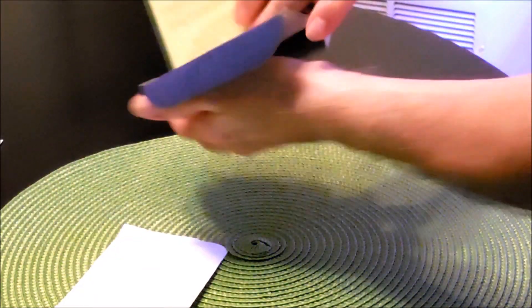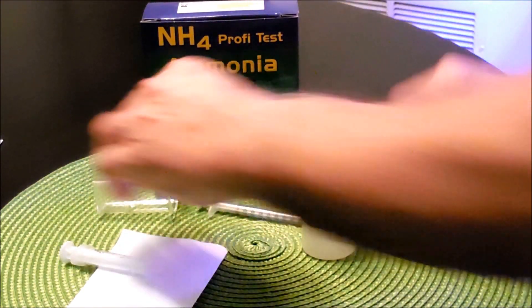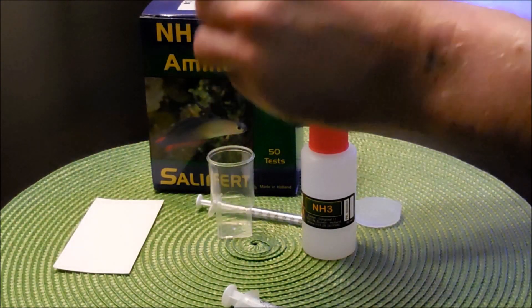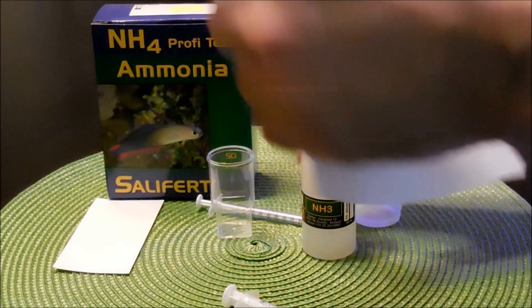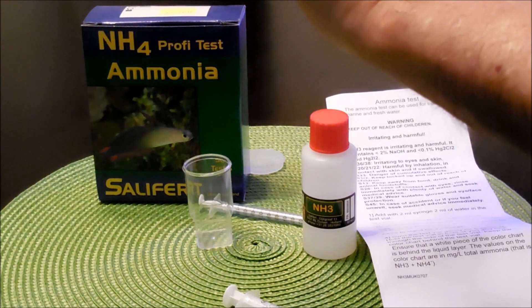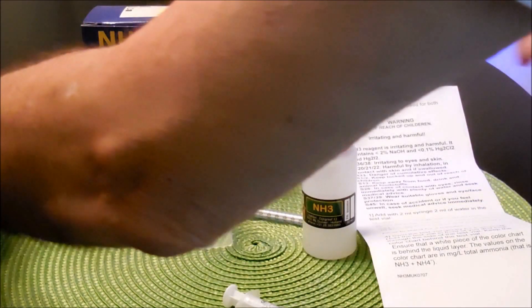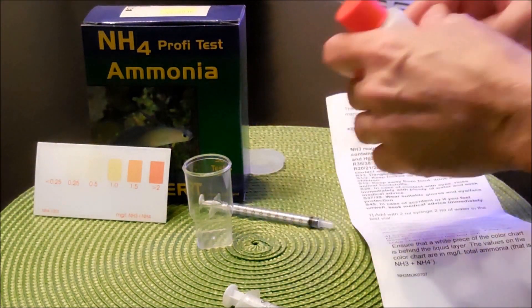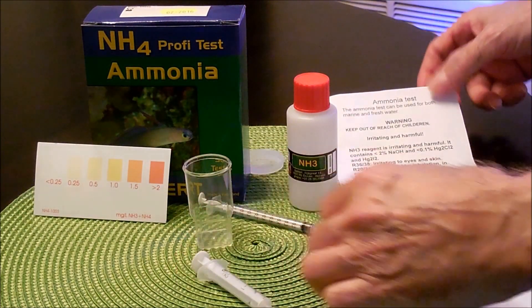Let's empty all the items here. We have the instructions, so let's put them right here while we're reading them. You have here the chart where we can compare as we go along. And of course the syringe and the other syringe for the water.